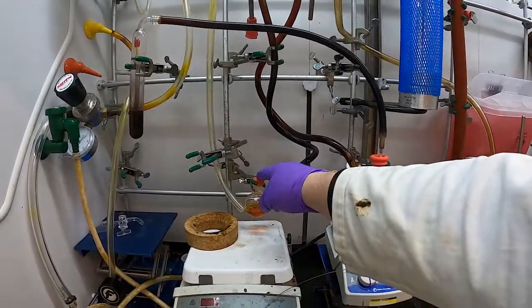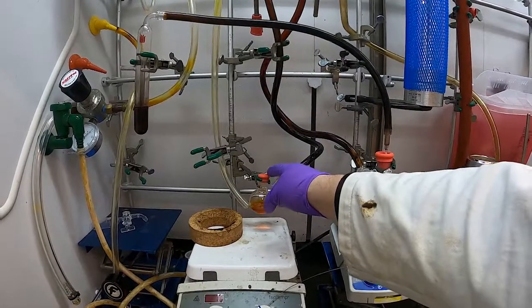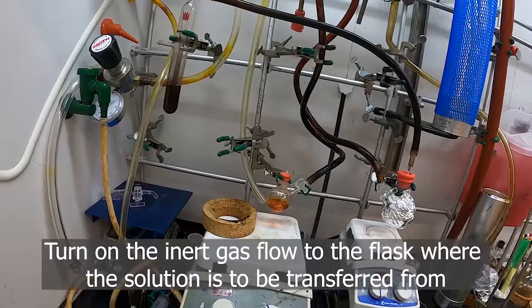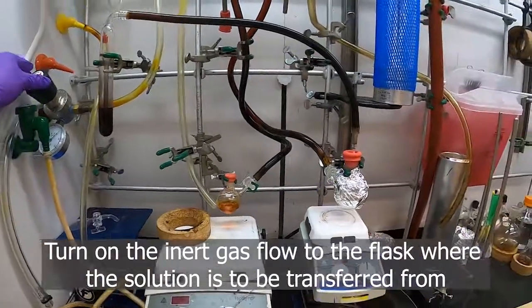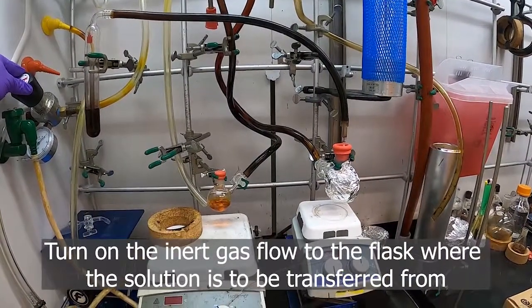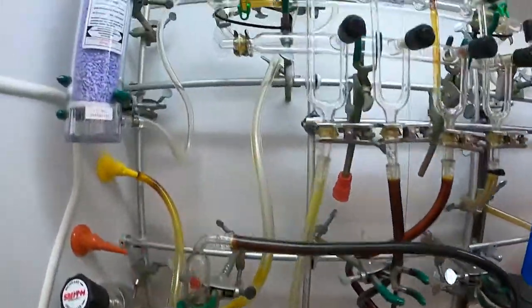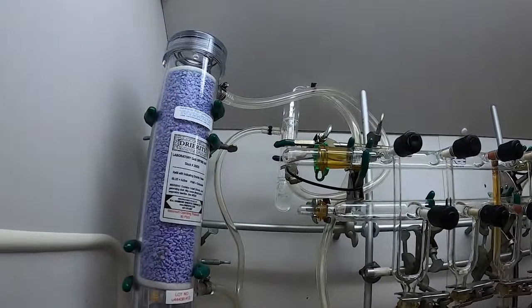Next thing we'll do is make sure that the flask where things are coming out of has nitrogen flow to it. So we'll turn on the nitrogen for that, and we've got a flow like that.